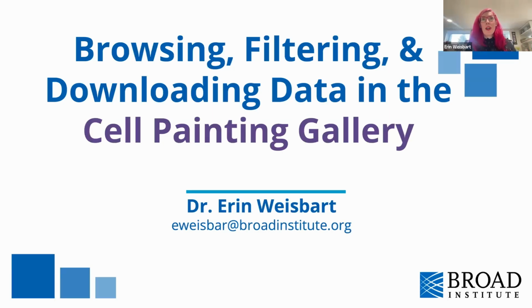This little tutorial is about browsing, filtering, and downloading data from the Cell Painting Gallery. Hi, I'm Erin. I've got my email on the slide. You are always welcome to email me and ask questions at any point after this tutorial.